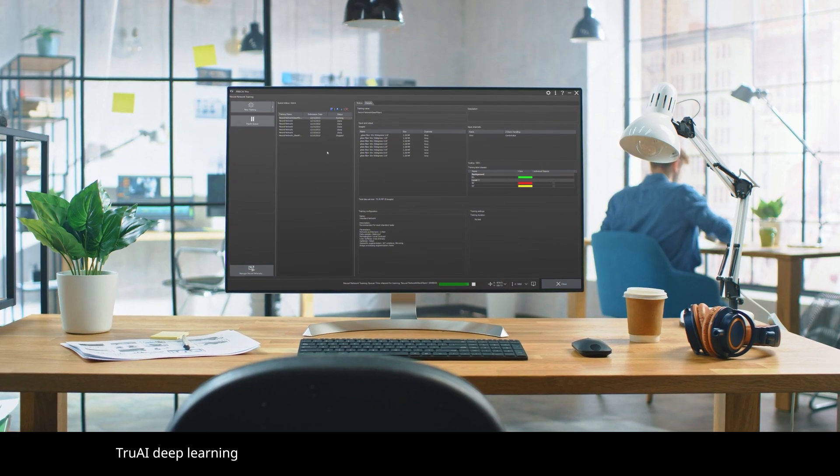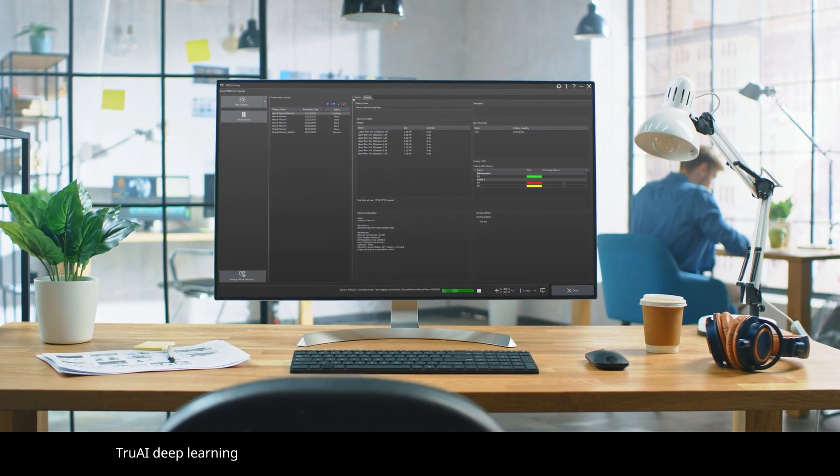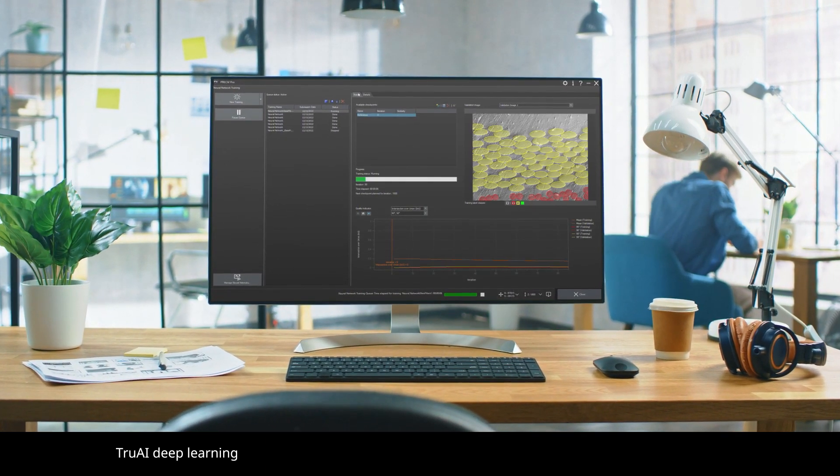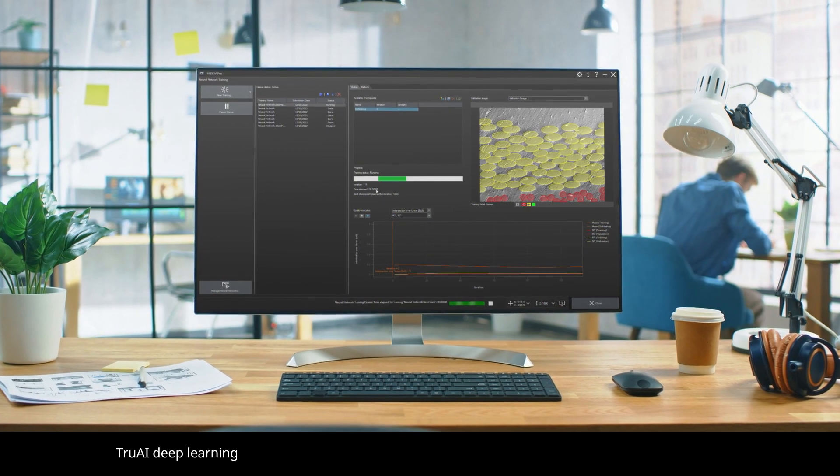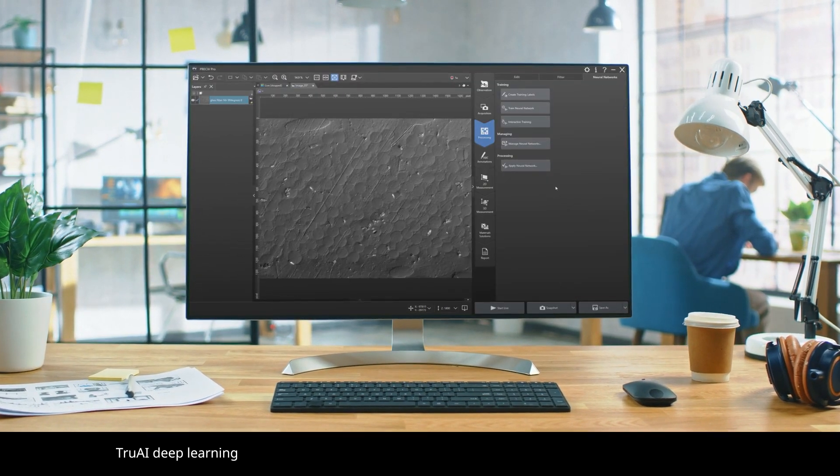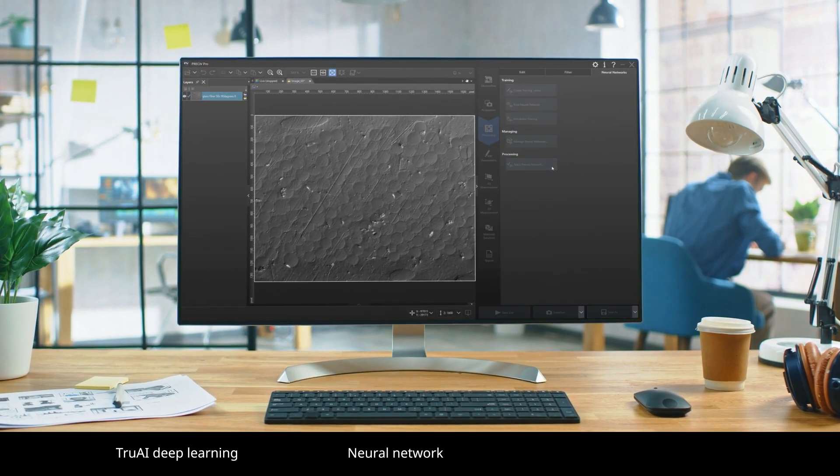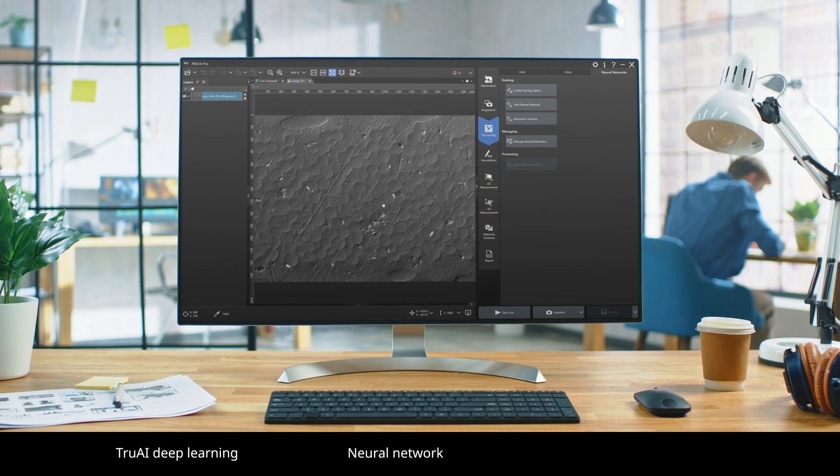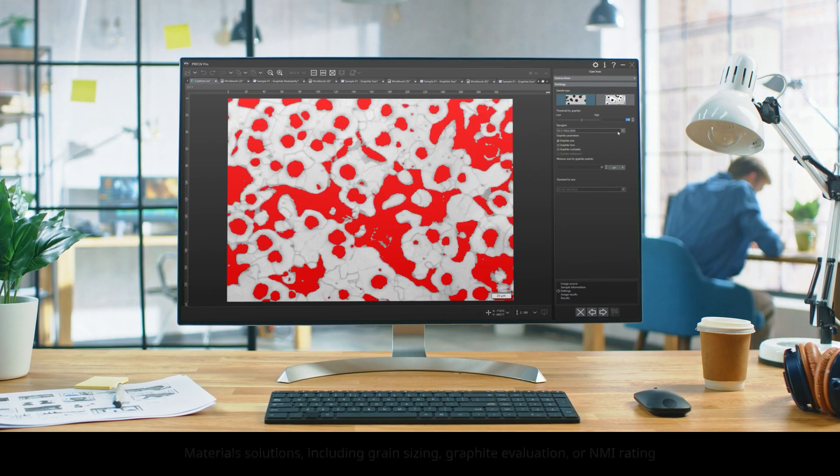Pressive True AI Deep Learning Technology offers image analysis beyond classical algorithms. Apply a trained neural network to your samples to easily analyze complex images with greater reproducibility and robustness.